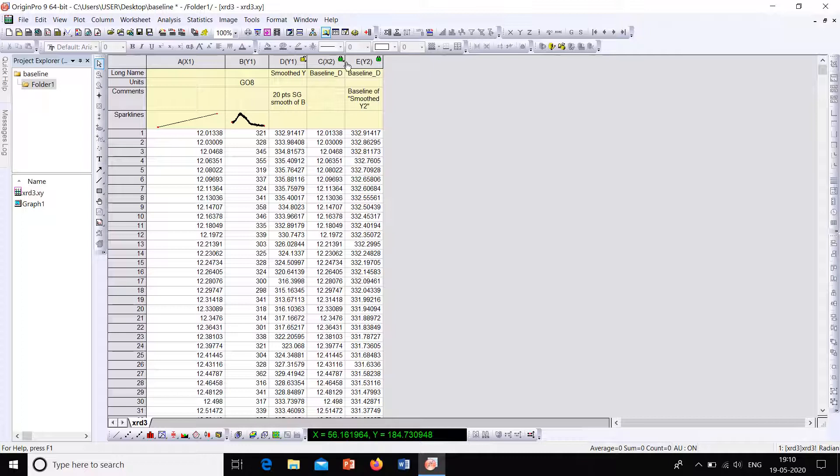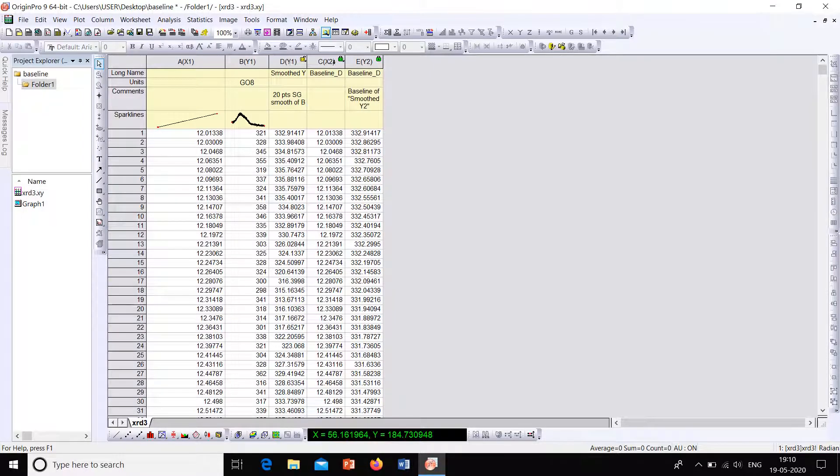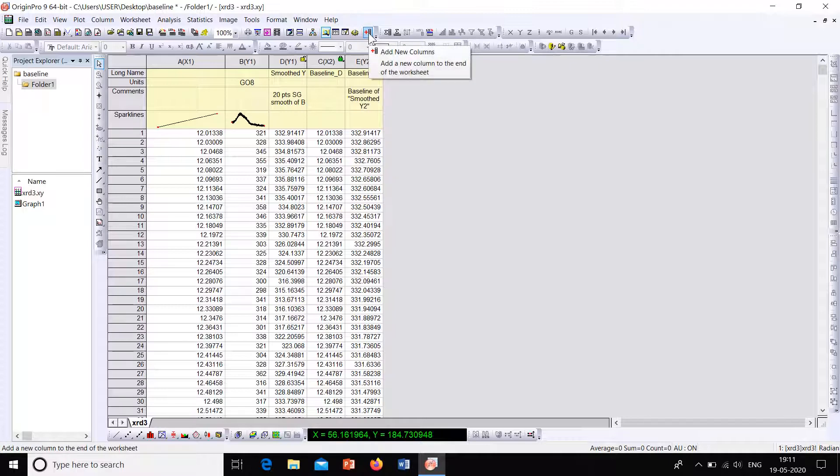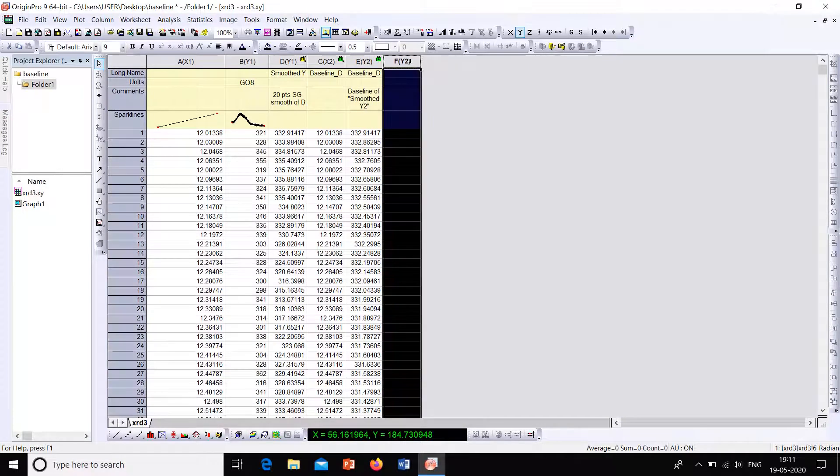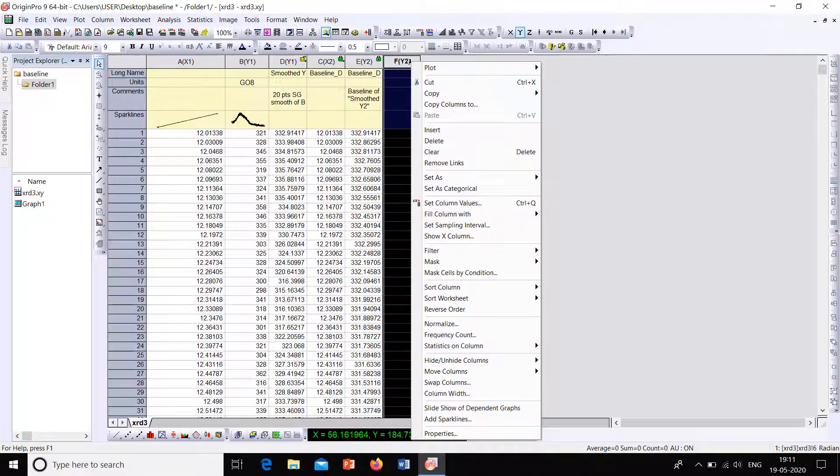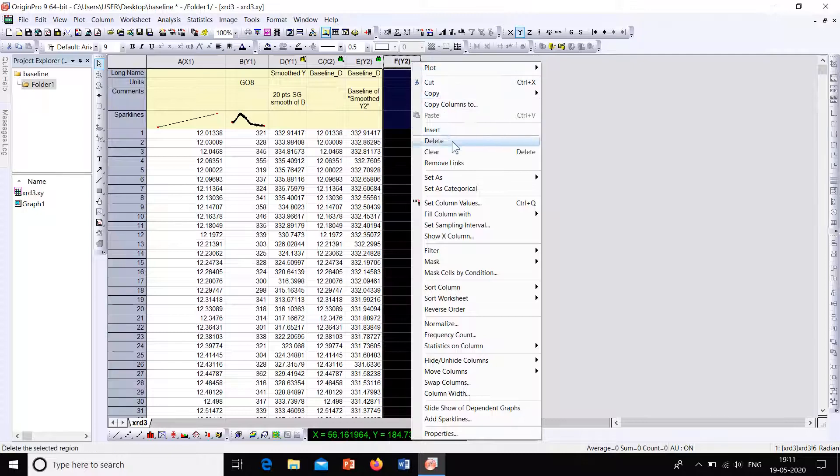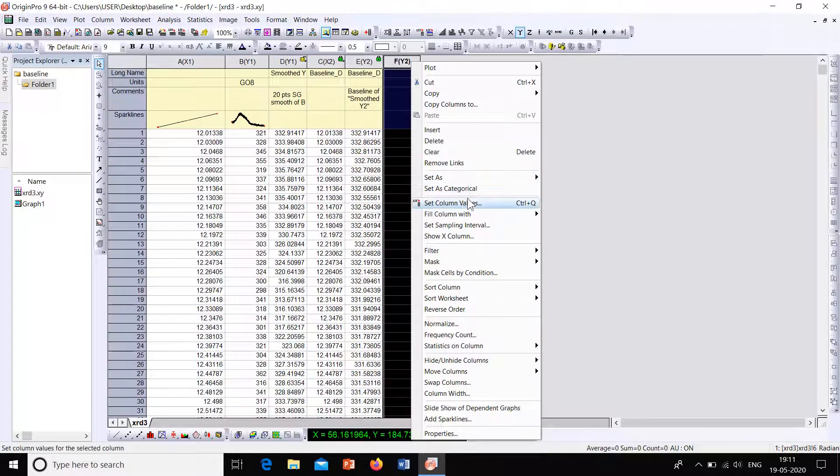Now this is the baseline and this is the graph. Now we have to subtract the baseline from the original plot. So for that create a new column. This is the option to create or add new columns. And now select the column and right click. Now here we can use inbuilt function to subtract one column from the next, which is similar to how we do it in Excel. Now select Set Column Values.